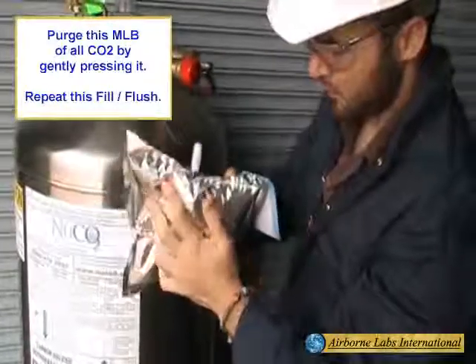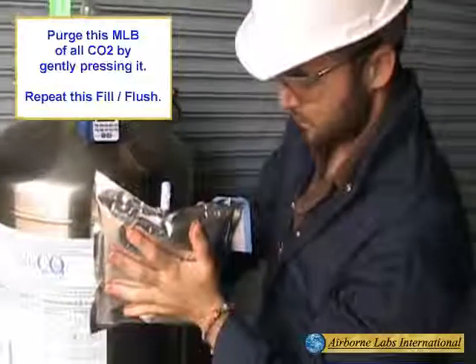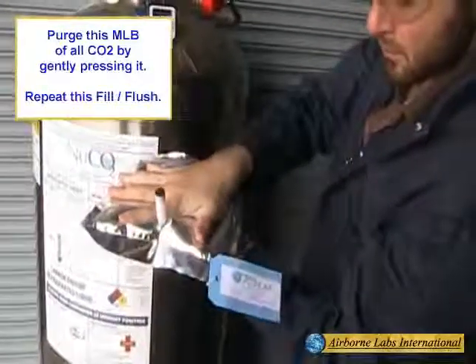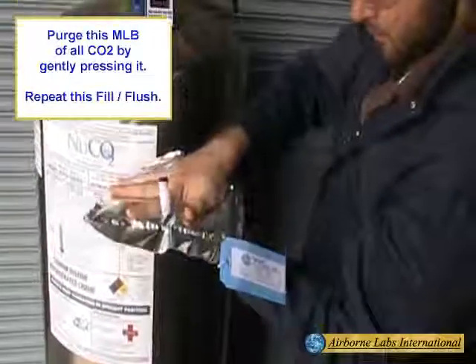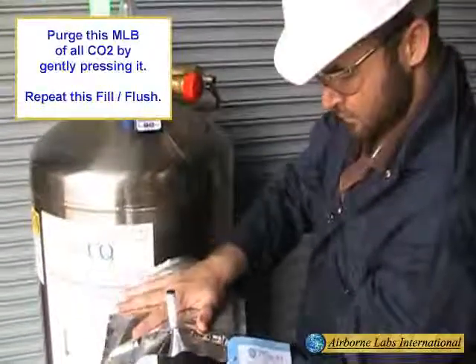Next, purge this bag of all CO2 by gently pressing it. Repeat this fill flush process.